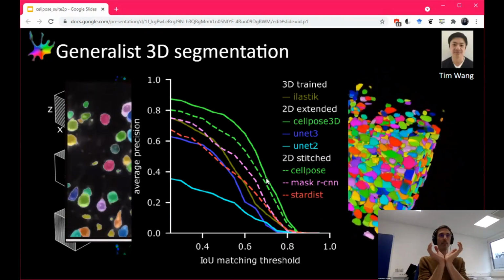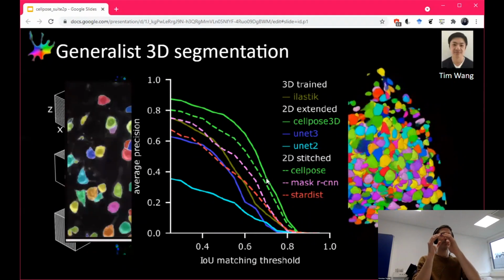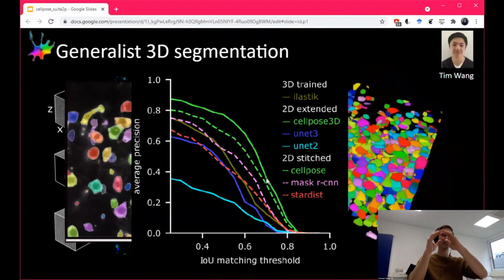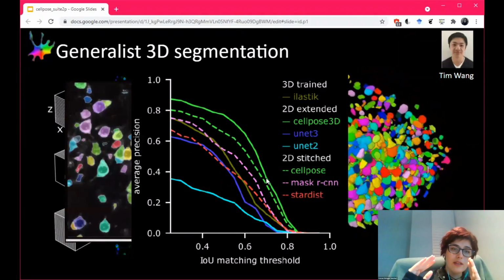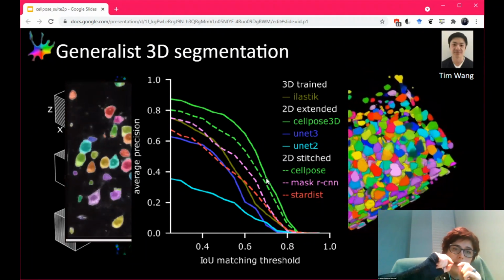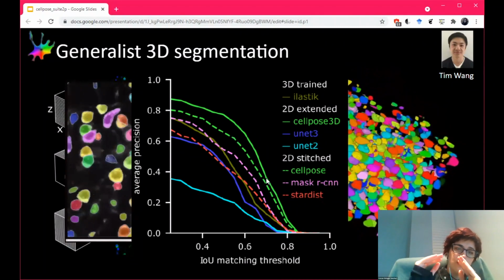I mean, let's imagine it's a sphere. Then it's thick in the middle and then thin, and then maybe there's another sphere on top. Yeah, if it tapers, that's why I'm saying, if there's enough sampling that you're getting smaller and smaller, then the IOU changes.